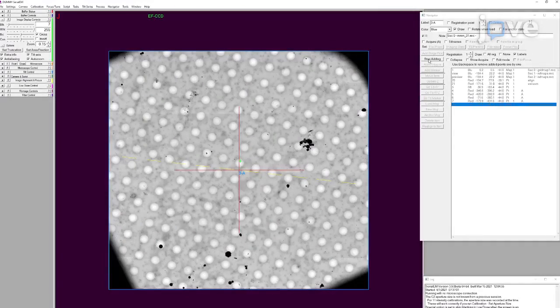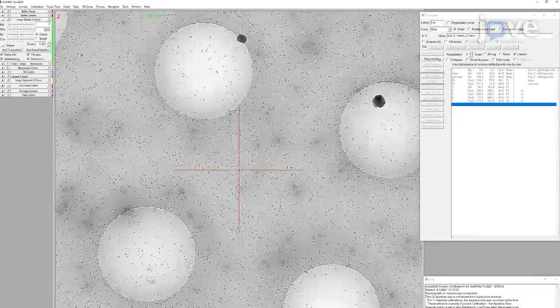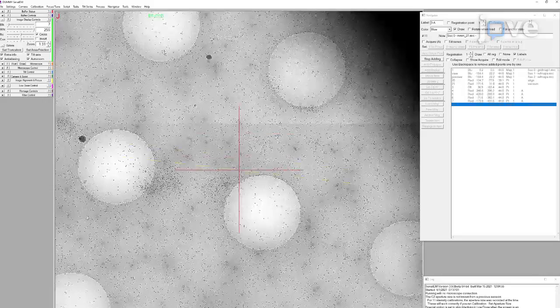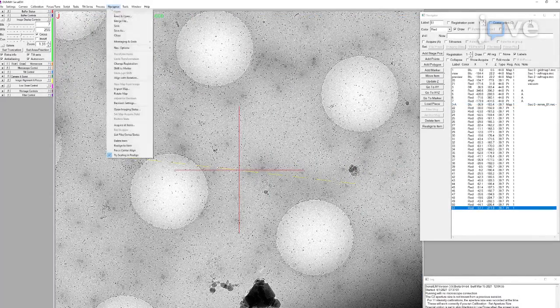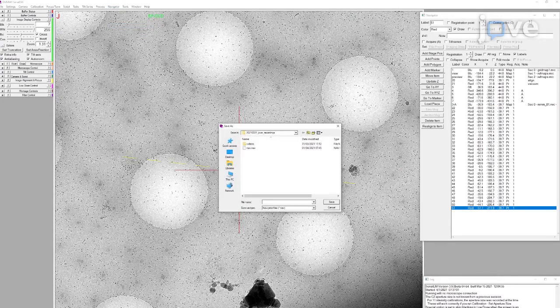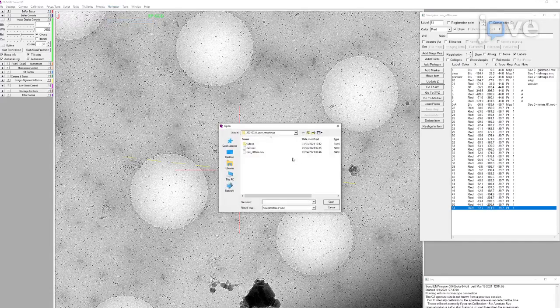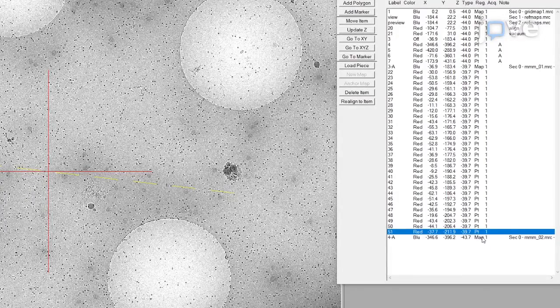Search the map and use the dummy SerialEM Navigator option, Add Points, to add image acquisition points on the target of interest. After mapping the new squares, save the Navigator file and merge the Navigator again. Continue until all grid squares are mapped.